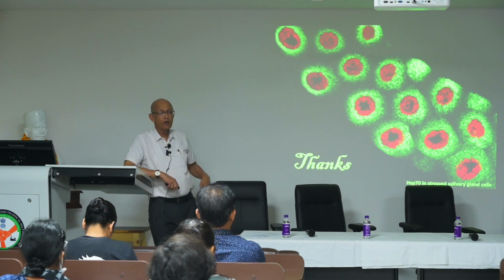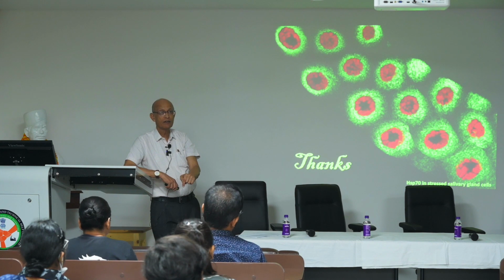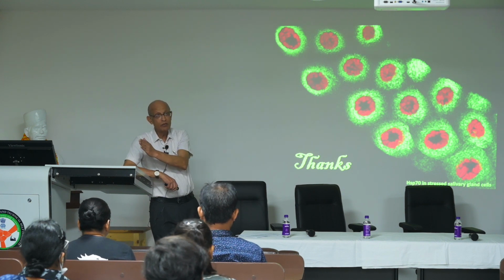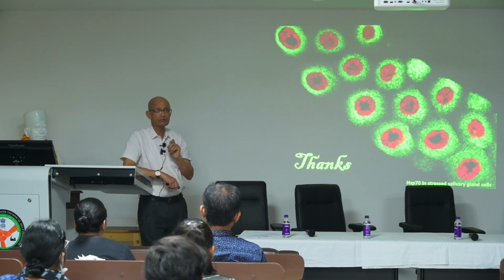But you see, one pinhole is only exciting that point along the entire depth. And that's what creates a blurriness. So we need to eliminate out of focus images, and therefore we need a second pinhole. The only case where we don't need a pinhole is when we use a multiphoton system.